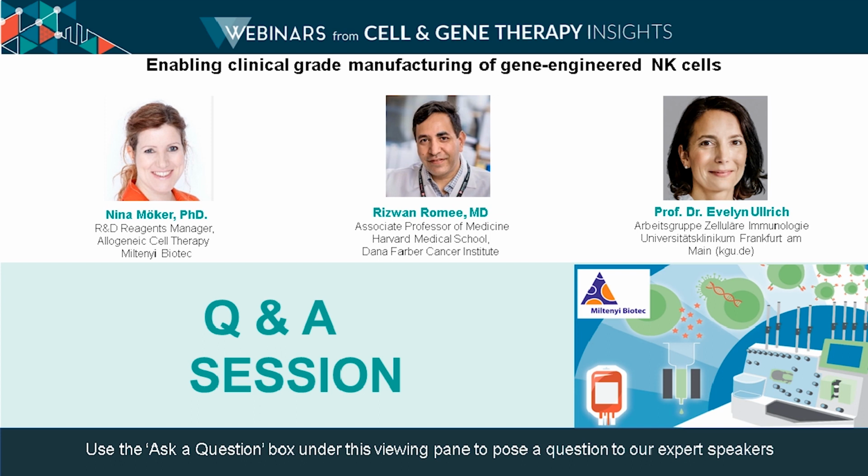Yes, of course. So, we have focused our efforts towards the lentiviral vector-based transduction because of the named advantages, right? That the clinical safety has been proven, the transduction is efficient, and it's able to transduce non-dividing cells. And as shown, and as Rizwan has mentioned, changing the pseudotype really helps transducing natural killer cells.